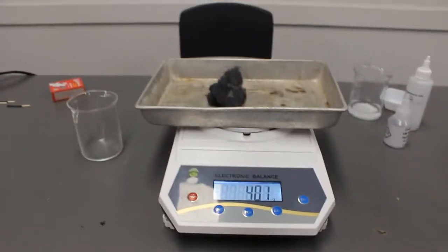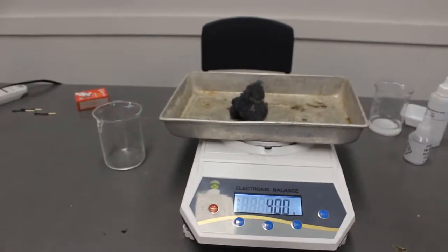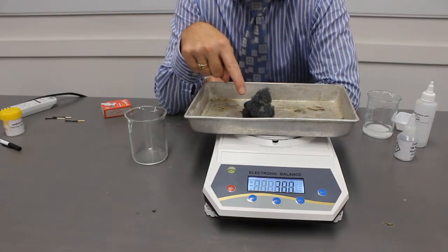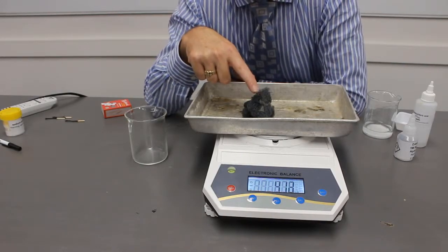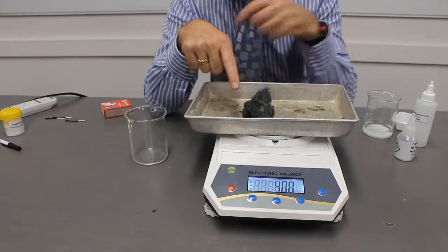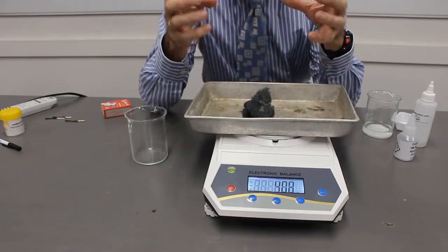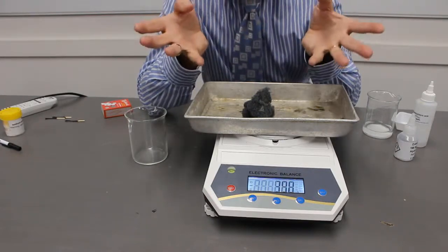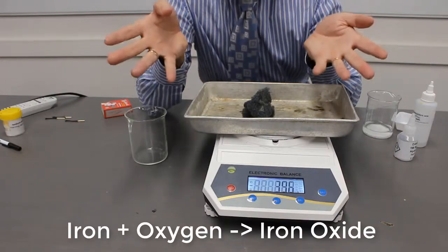So the mass has increased. What on earth is going on there? How has the mass increased? So I mentioned this blue color. This blue color is now called iron oxide. So what's happened is that oxygen has bound to the iron. And that's what the new product is.